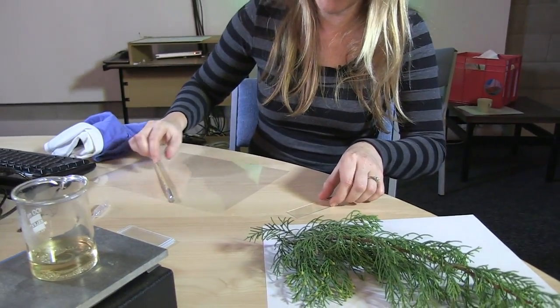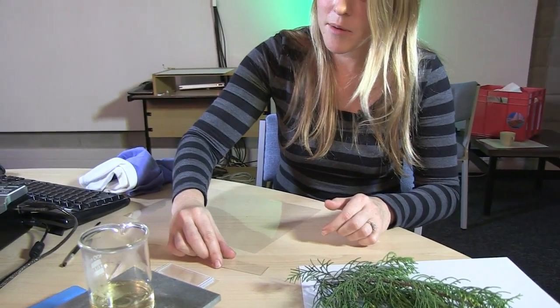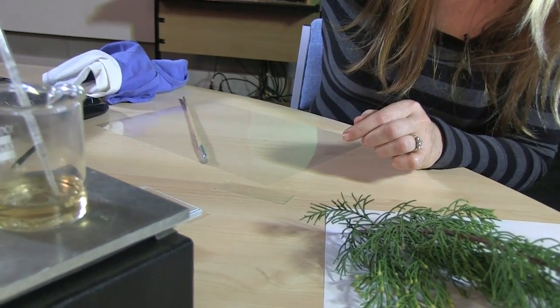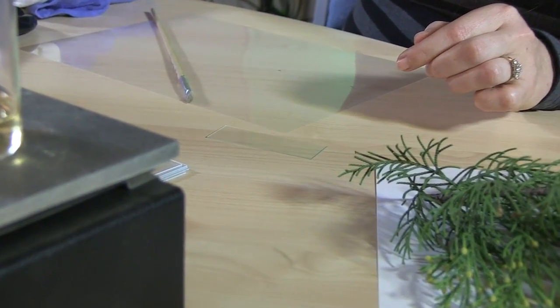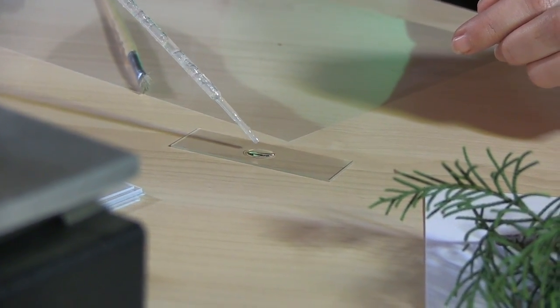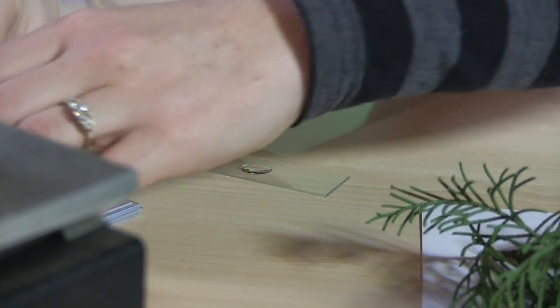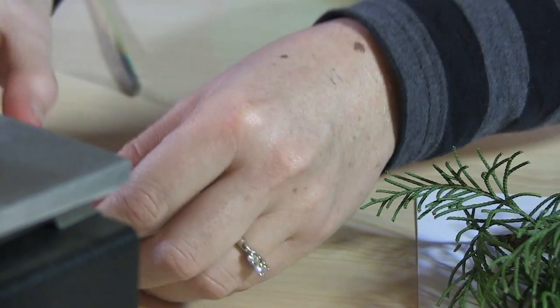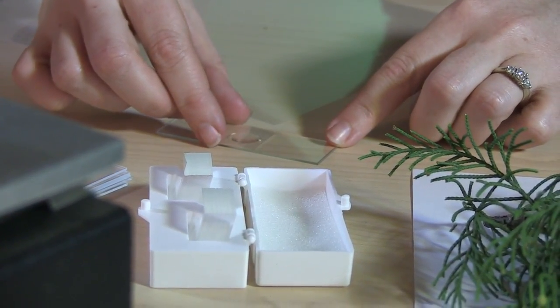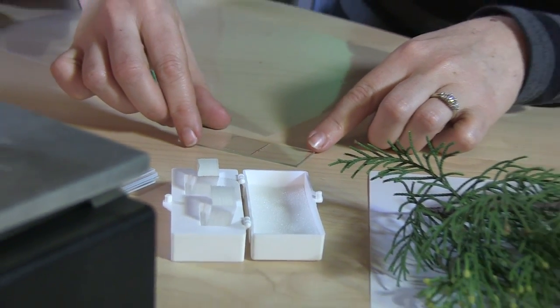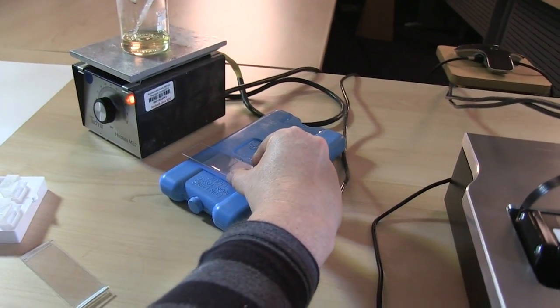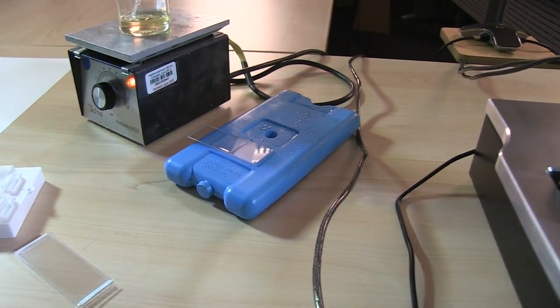And then once we have that sample material on the slide we place a drop of glycerin jelly, liquid glycerin jelly onto the slide like so and then cover slip and allow that to spread, and so then we cool the slide to encourage the glycerin jelly to set quick.